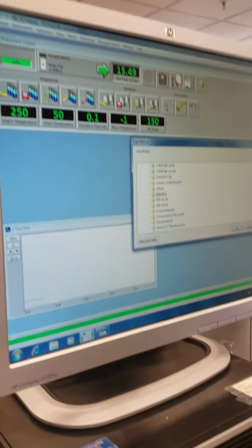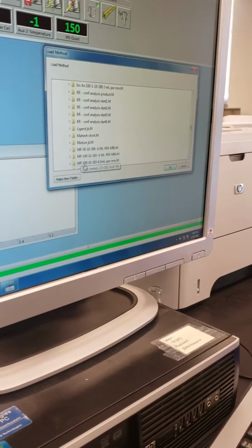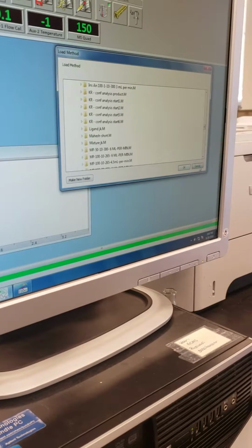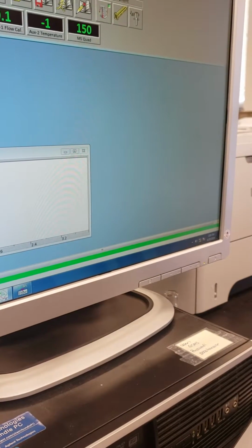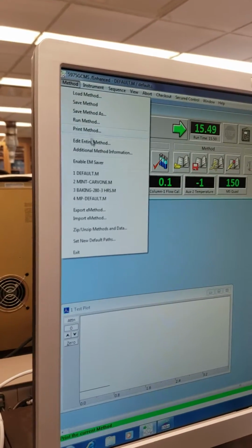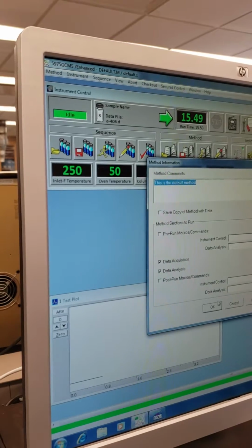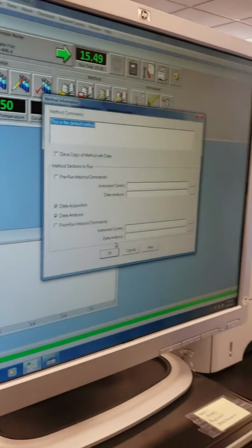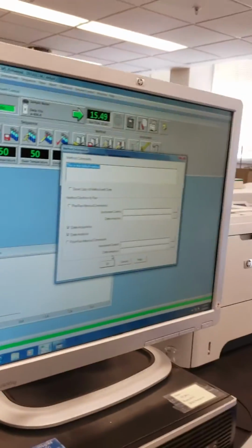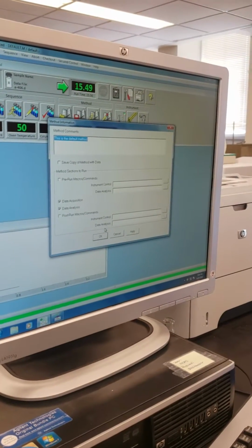So that way we will hashtag all of his with an MP starting. Yeah, probably I will call mine just Valencia, and we will save everything there. Methods. Yeah, and then create a method. Okay. If you want to give it a summary name, we will call it Valencia.